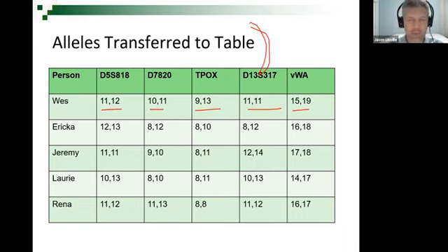All of them are labeled. They all have a little fluorescent dye attached to them. So when they're all jumbled up, I just shove them into the beginning of the capillary. But as they travel through the capillary, all of those alleles are going to separate and move together, along with all of the other millions of copies of alleles. And then they're going to hit the detector window.